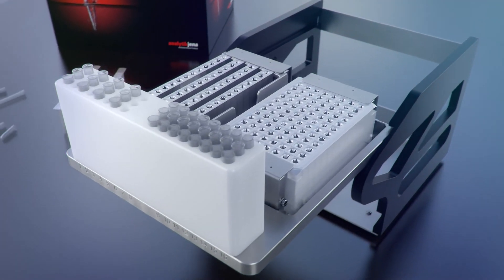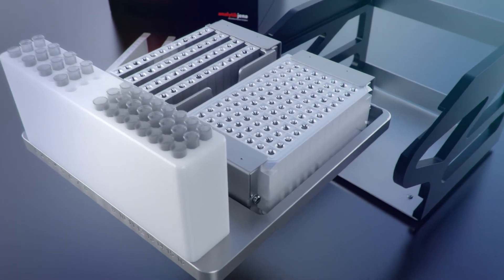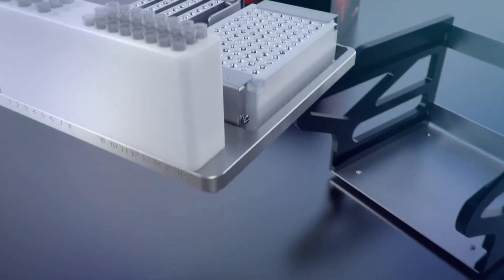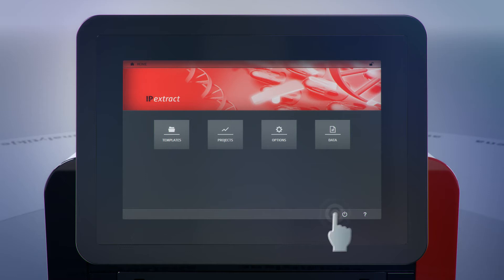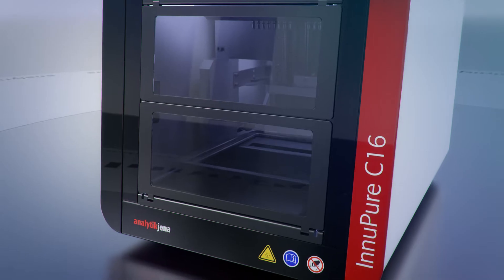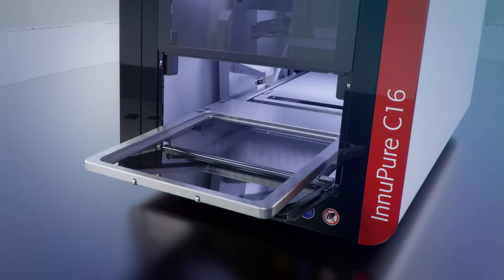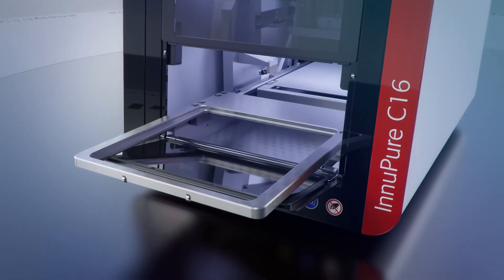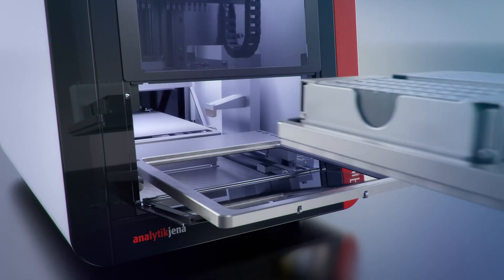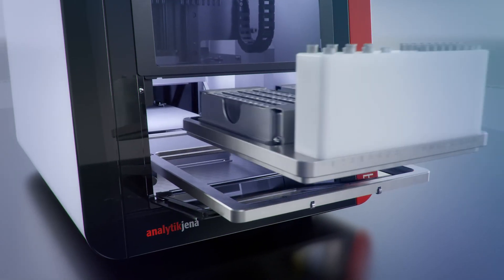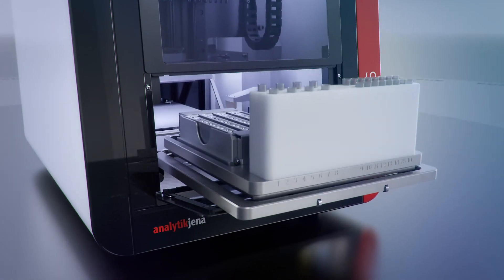After adding the sample, users can simply insert the tray into the instrument. The integrated opening and closing function of the front door facilitates the insertion of the filled tray.